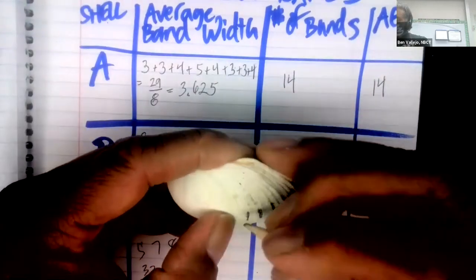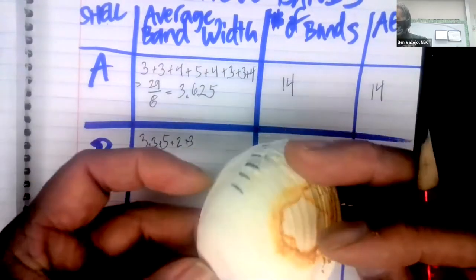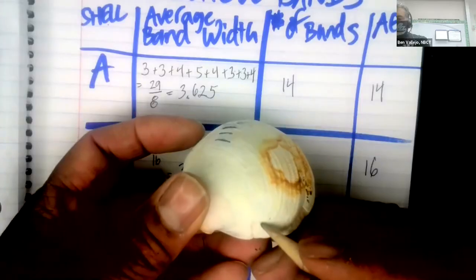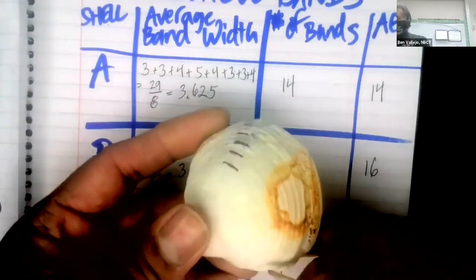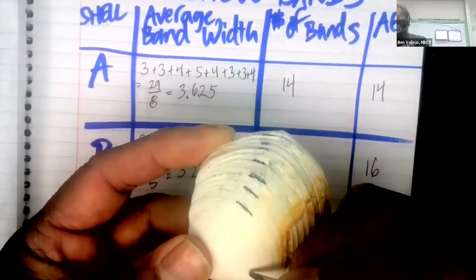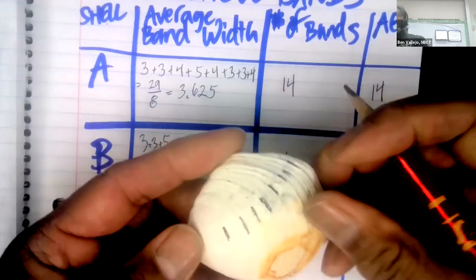And I'm marking these, and you can feel them. And like I said before, you can see them on the edges sometimes, but this one's not as good at that. Well, here, this edge, you can see the band right there, and it moves over. That's it. Here's the other one. Here's the next one. And the next one would be, if I follow that along, oh, that doesn't seem like an obvious band to me, but that's where it is.